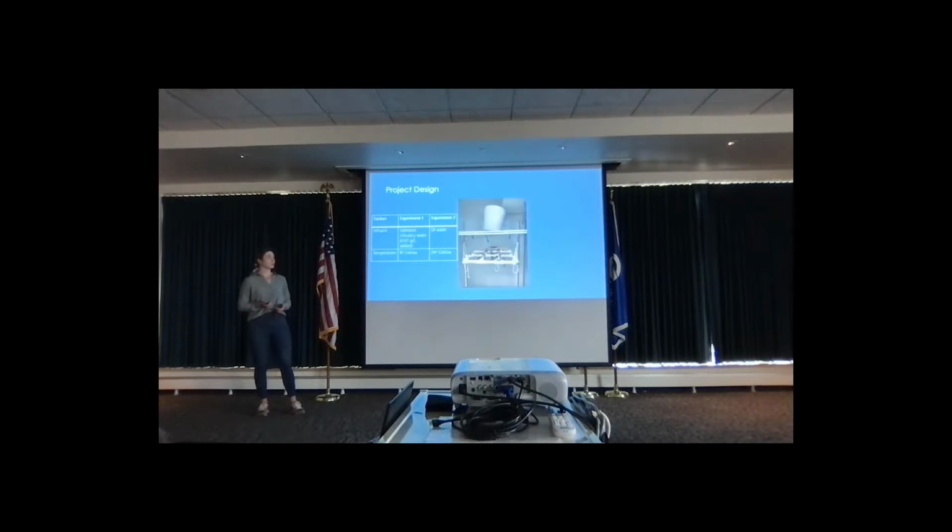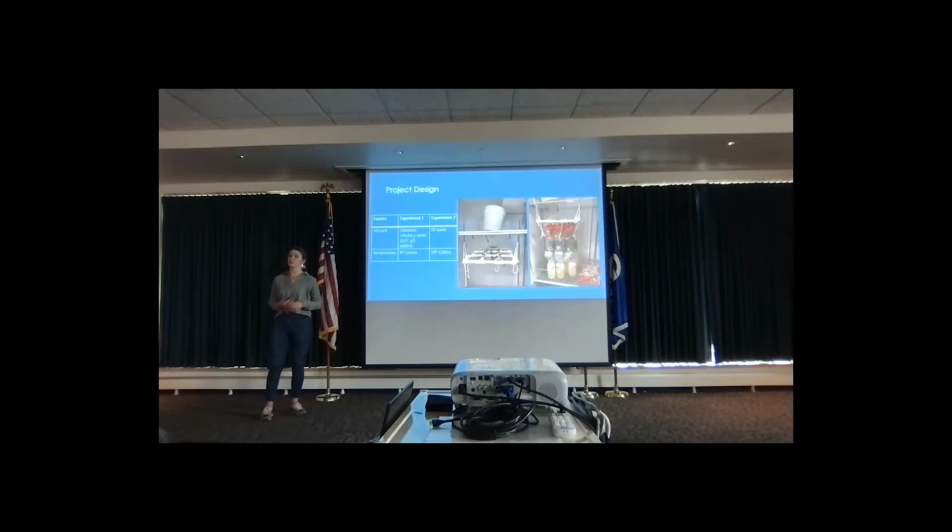Now, when it comes to dispersing the water, I decided to build gravity-fed drip systems for this. And as you can see here, there was a bucket up above that then fed water down to the drip valves connected to this PVC grid. And they were each calibrated to about 200 milliliters per hour. And then they were inserted into the cores that were hung from that PVC grid. And then water was allowed to drip into the tubes for about 3 hours per experiment. And then the water percolated through the sediments and the effluent was collected out the bottom here.